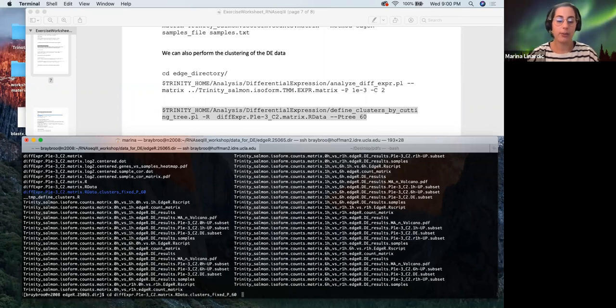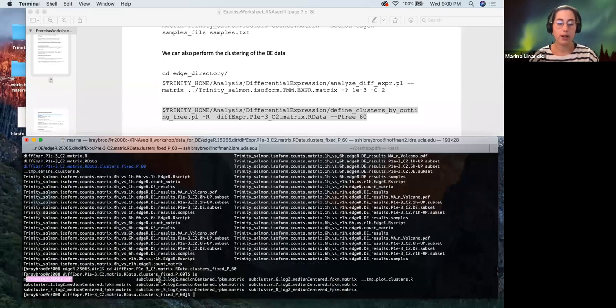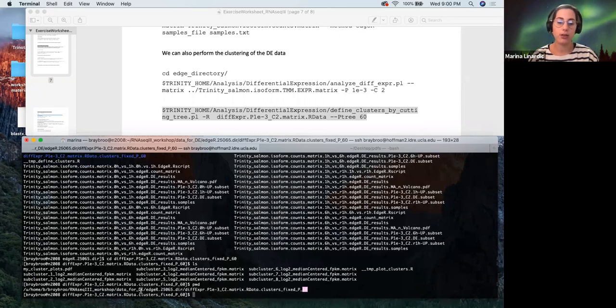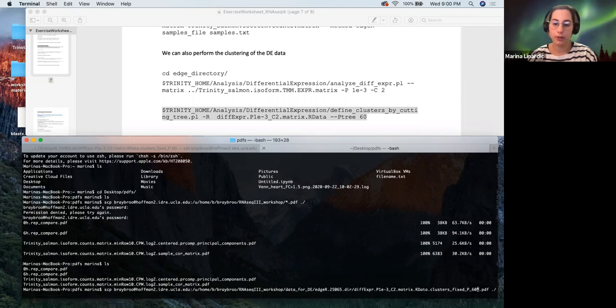Here we're going to have the plots in this PDF file. So let's very quickly look at this. I'm going to do it just on my computer. So we copy this path, go back to my terminal here, and I'm just going to put the path right here to get the PDF for the plots.